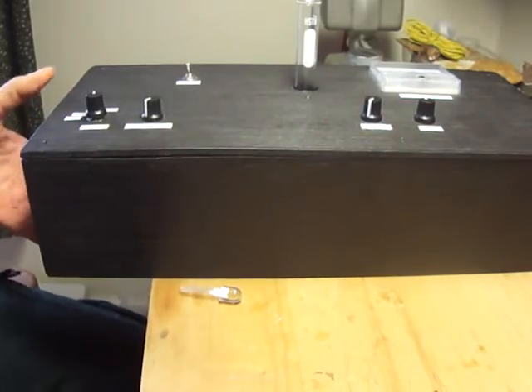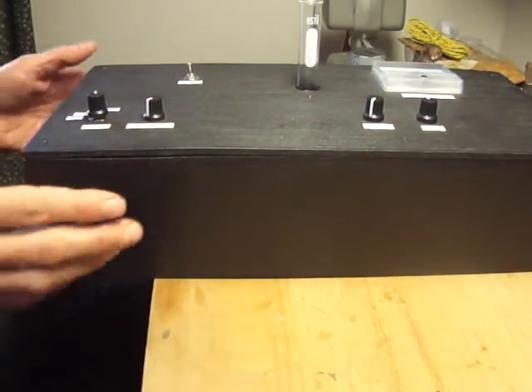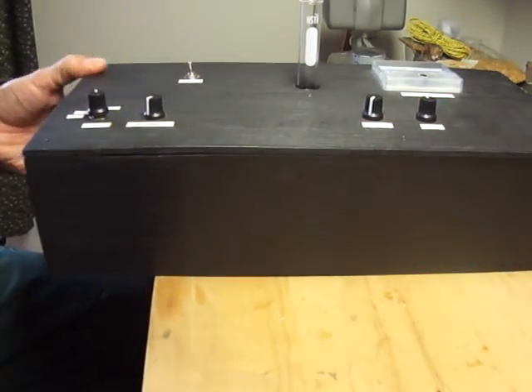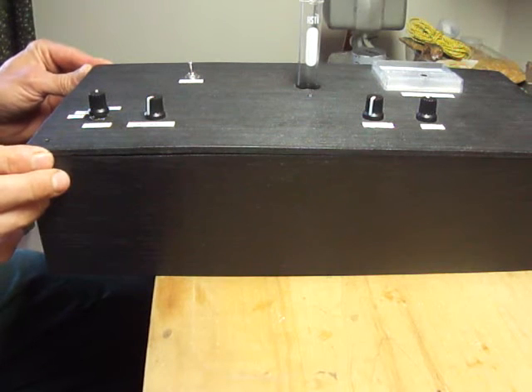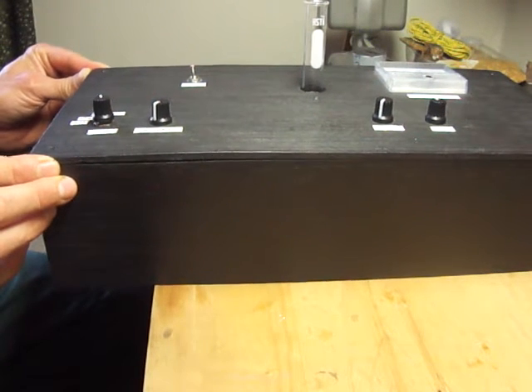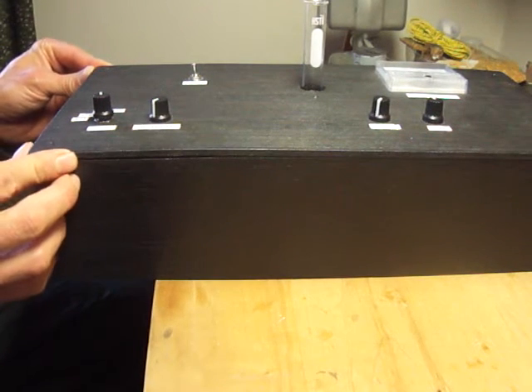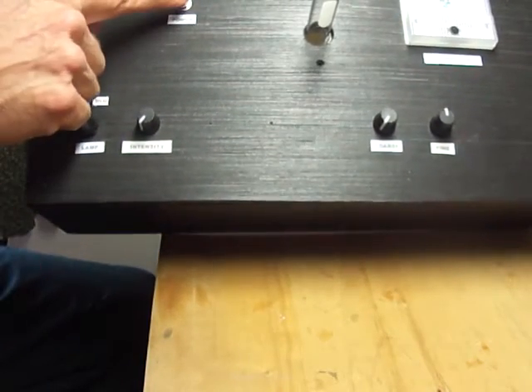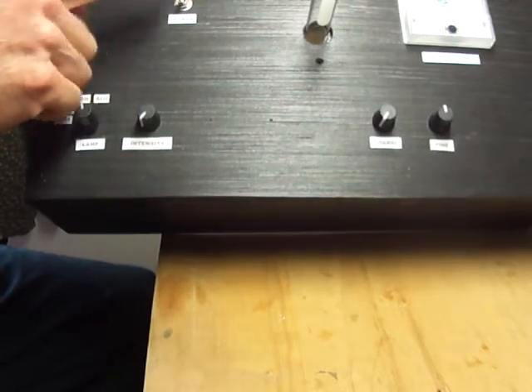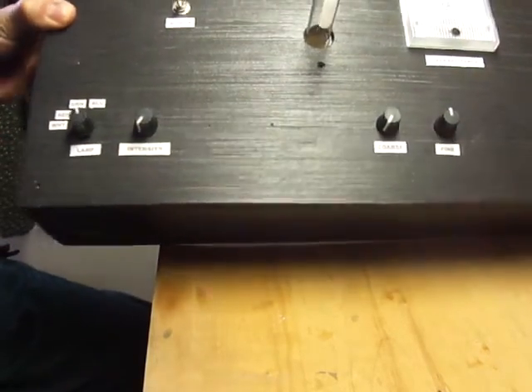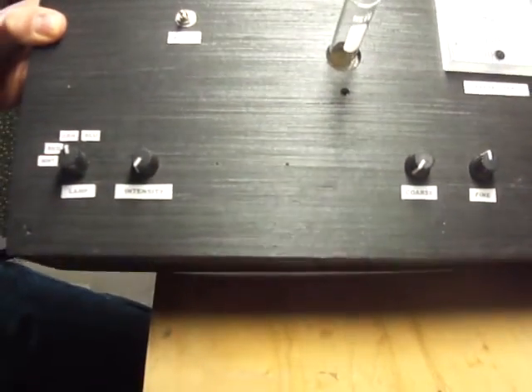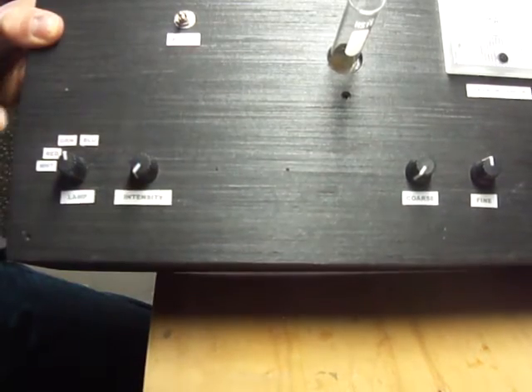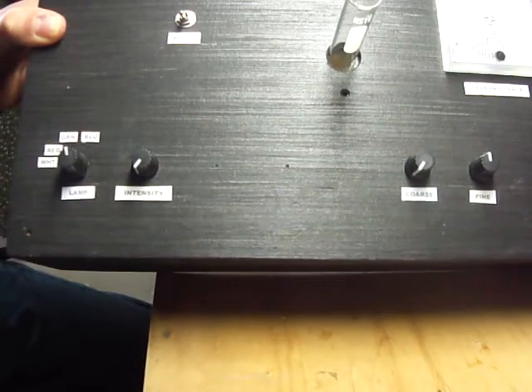Basically it's just a wood box, and I painted it black inside and out to help keep ambient light from interfering with anything. It has a power switch to power the whole thing.